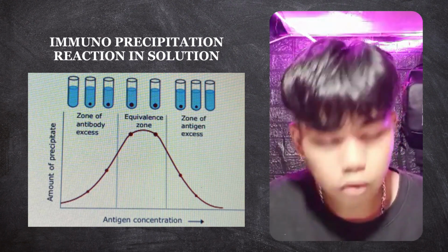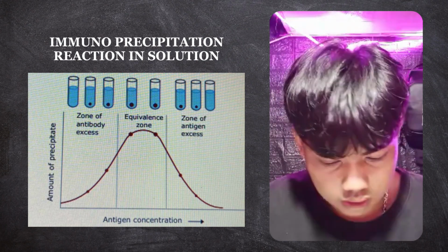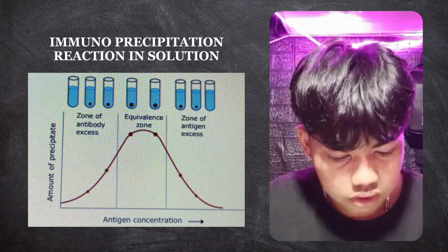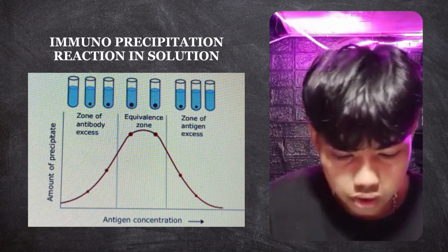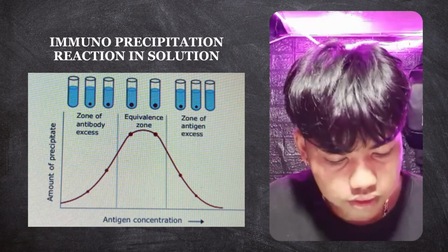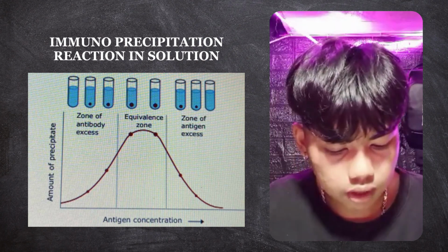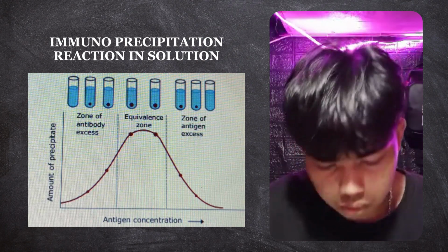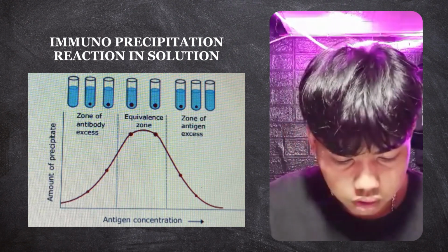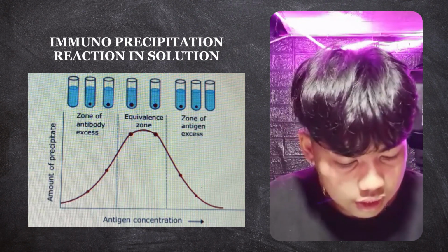The procedure involves formation of an antibody complex, followed by precipitation of the complex and separation of the target protein from the rest of the cellular components. Gel electrophoresis is often used as the subsequent step to analyze and visualize the immunoprecipitated protein. So here's the general overview of the immunoprecipitation reaction and its analysis in gel.